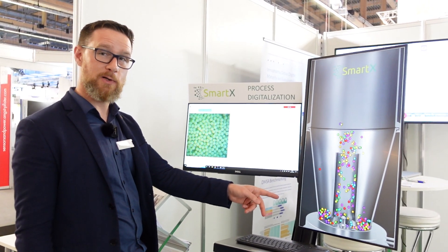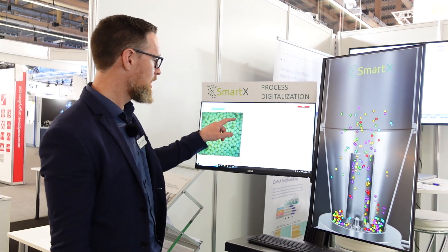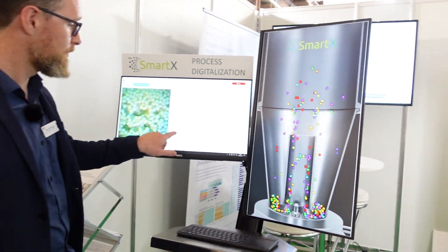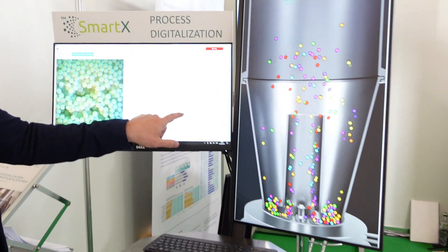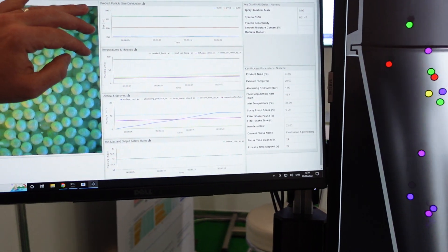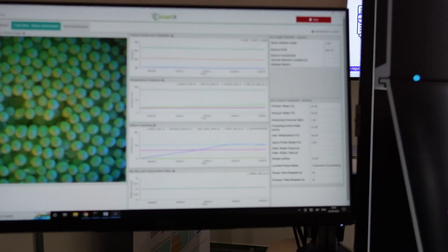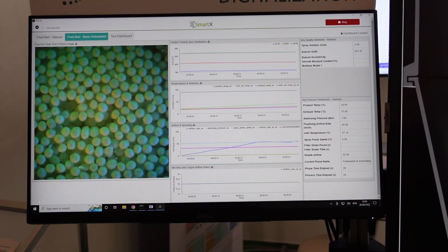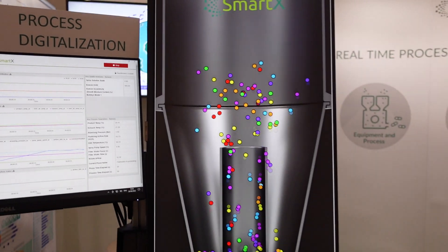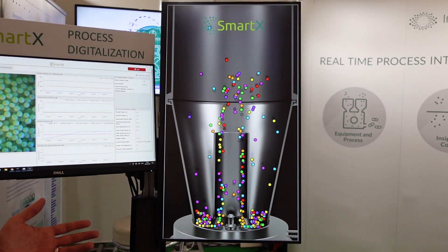We can see the virtual fluid bed is starting to fluidize — it's getting air and we can see that ramping up here on the charts for our airflow, so they're starting to pick up speed as well. We're measuring our particle size as it goes, and this will continue until we reach a target profile of a certain coating thickness on these particles as well as a moisture content, and then actually stop our process.